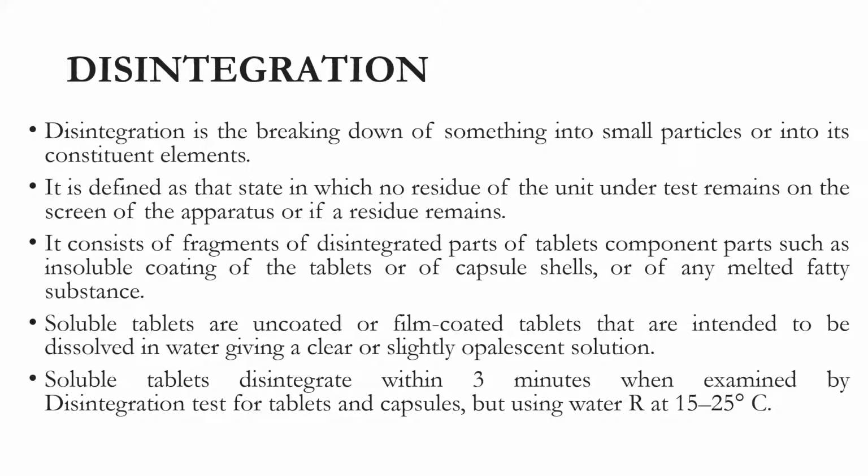Another test is disintegration. Disintegration is the breaking down of something into smaller pieces. Small means they have other constituents. It can be defined as a state in which no residue of the unit under test remains on the screen of the apparatus. It consists of fragments of the disintegrated parts of the tablet, like the insoluble coating of a tablet or capsule shell, or any melted fatty substance.